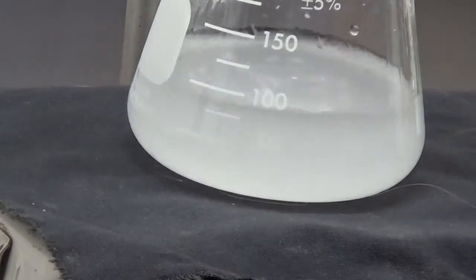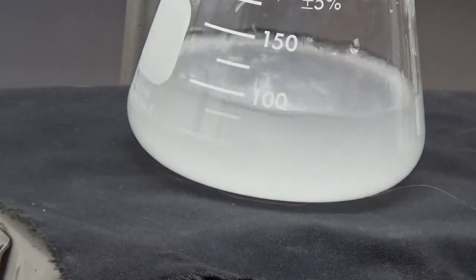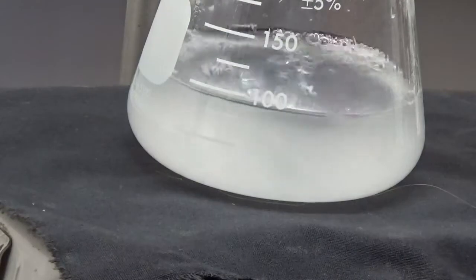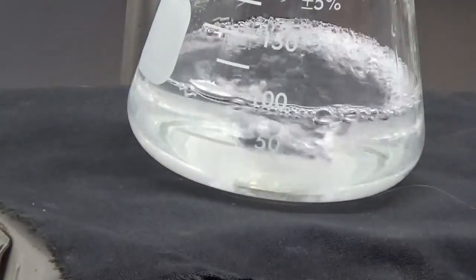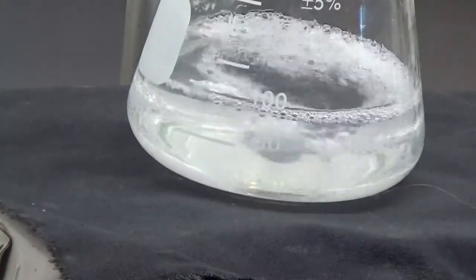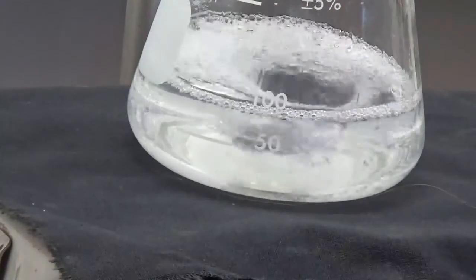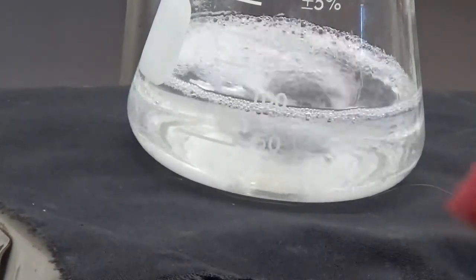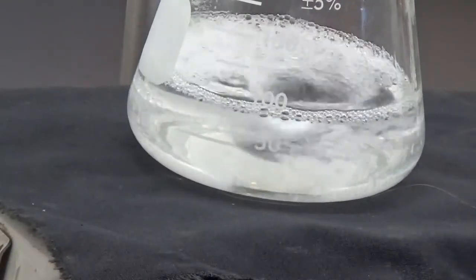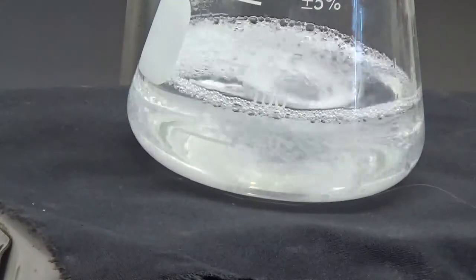Bunch of drops. Oh, just cleared up. All right, I'm going to take that volume. .12 milliliters.